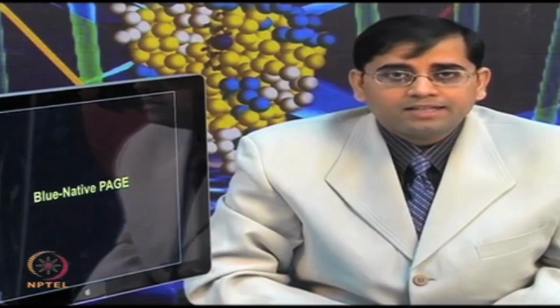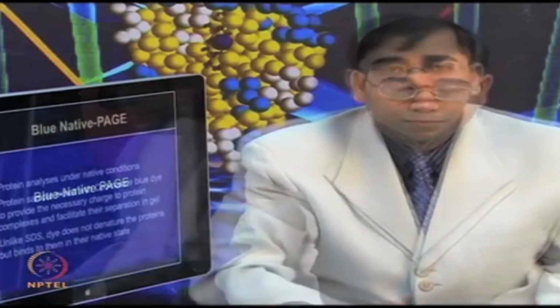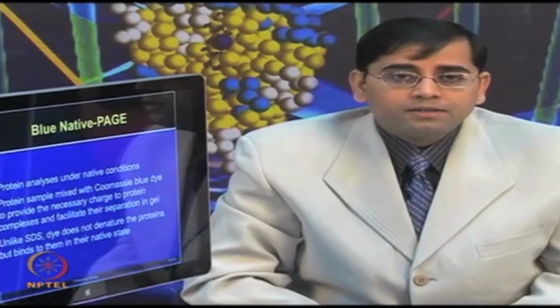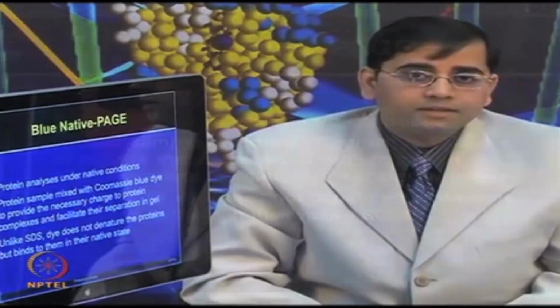So, I will briefly describe the blue native PAGE here. Please keep in mind, this is not going to be used for 2D, but often people also use the native form for the 2D separation. In blue native PAGE, the protein analysis is performed under native conditions.